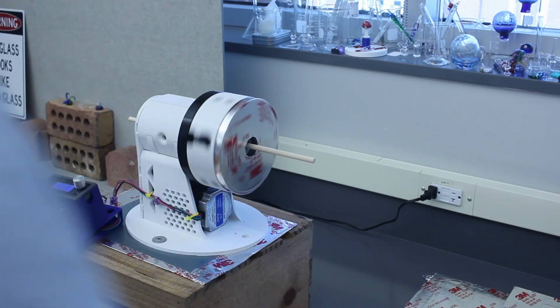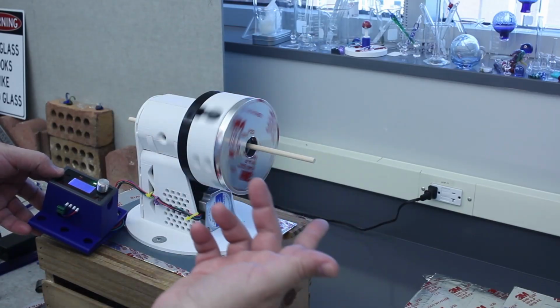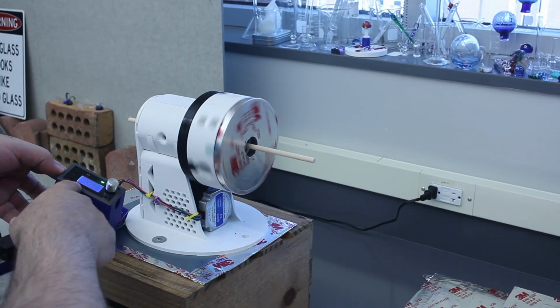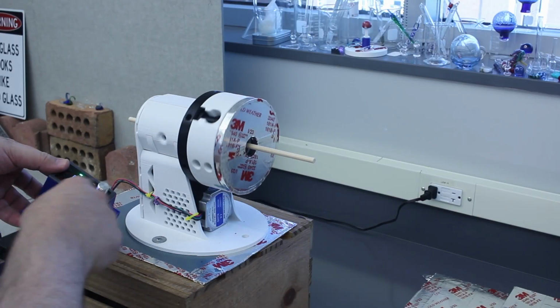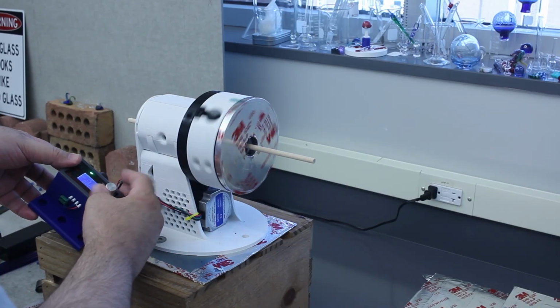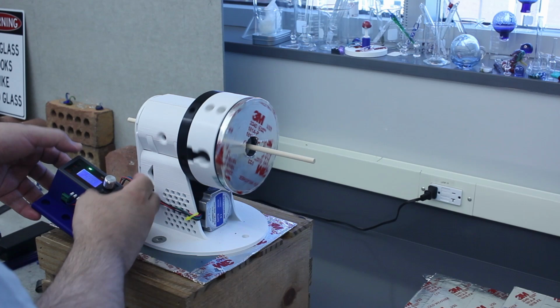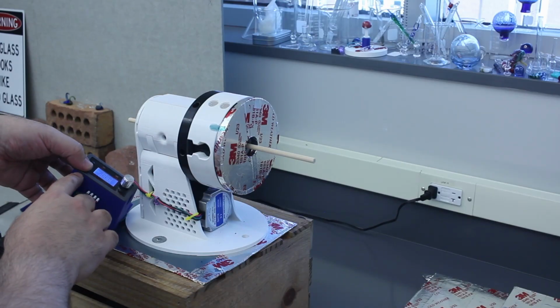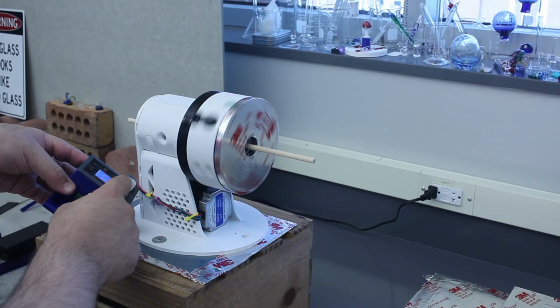But that's pretty good. So it's rotating, and again with the controller, depending on how you have it wired up, right now I'm rotating counterclockwise according to the controller, but if you actually look at it, it's going clockwise. Clockwise is at a different speed. I can speed that up or slow it down as needed. I push counterclockwise, that starts it, and I push the same button and it stops it, or I can start it and then there's a start-stop button.